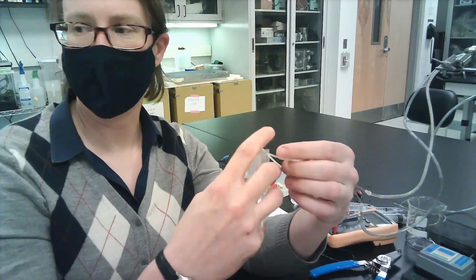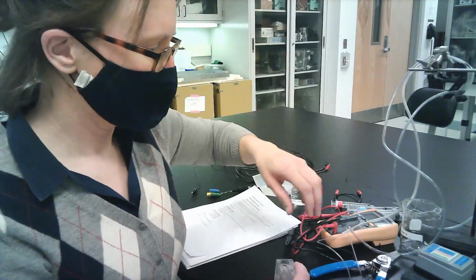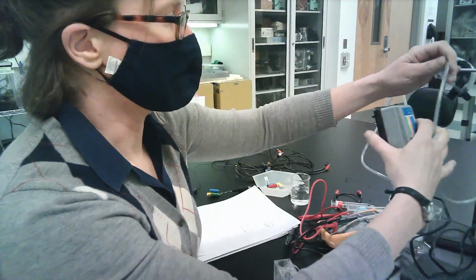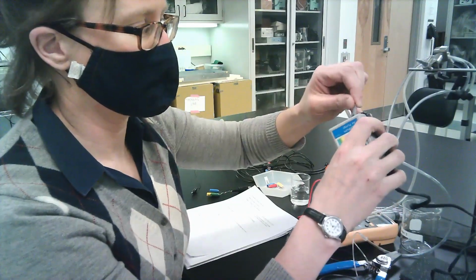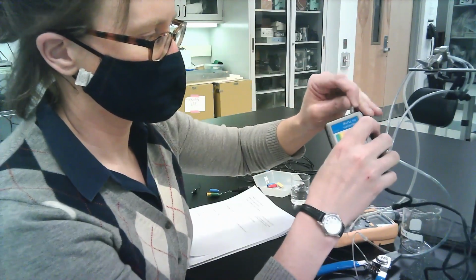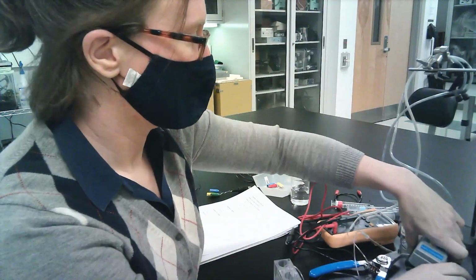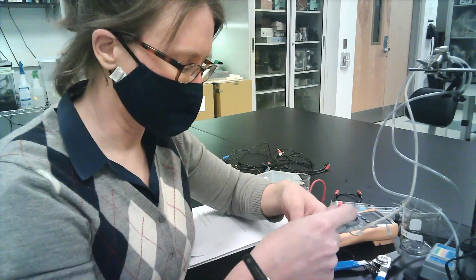And that whole apparatus is then hooked up to a little splitter, and eventually that will run back to an air pump. So when you're ready to get started, you'll just plug that into the air pump, plug in your air pump, and then flow oxygen to both sides.